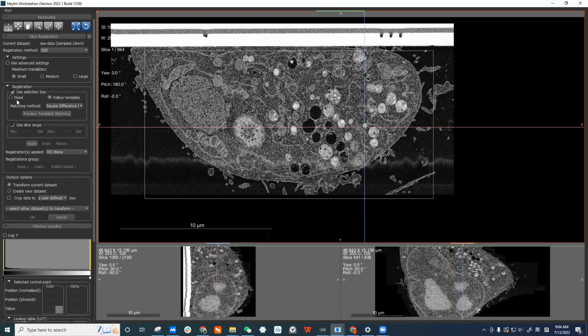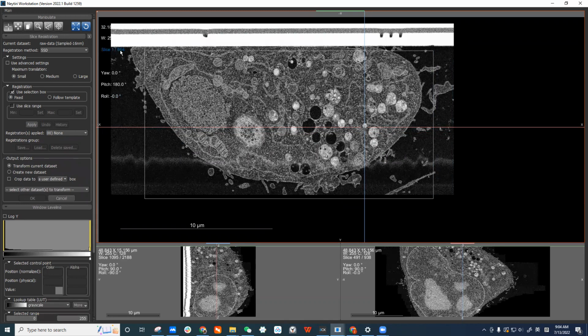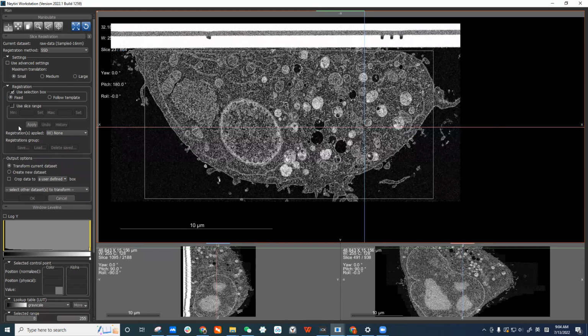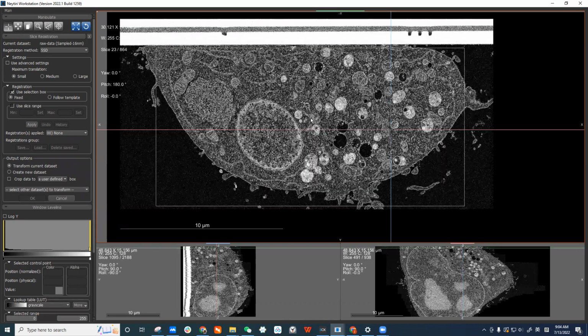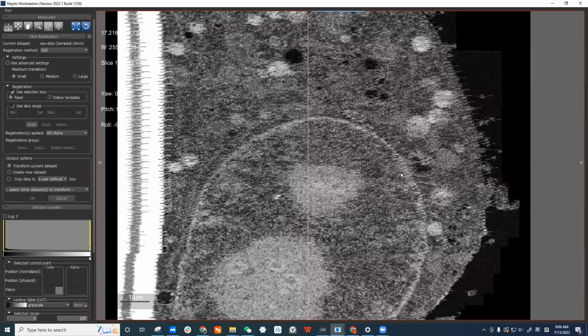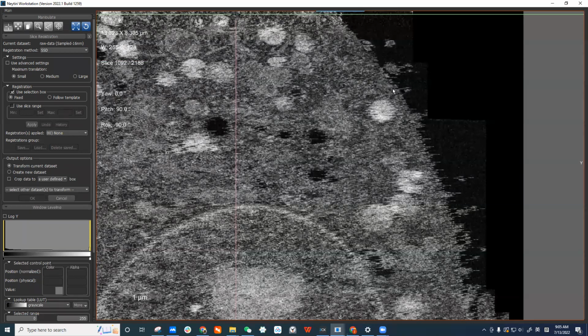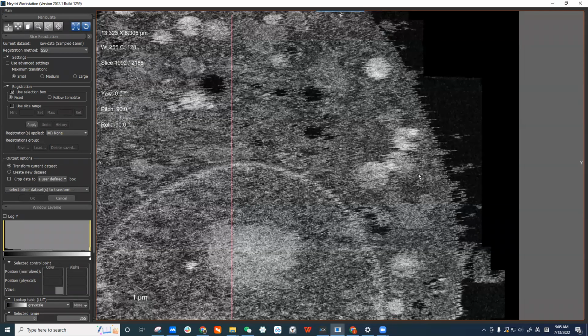So this one I use fixed because it doesn't move too much. The box itself should be okay for all slices. So I can start with the offset, the small offset. The big view on the top is the image plane view. The bottom two views are from the other axes. So now this is X, Y, Z. We see it's not smooth, so there's a lot of misalignment.